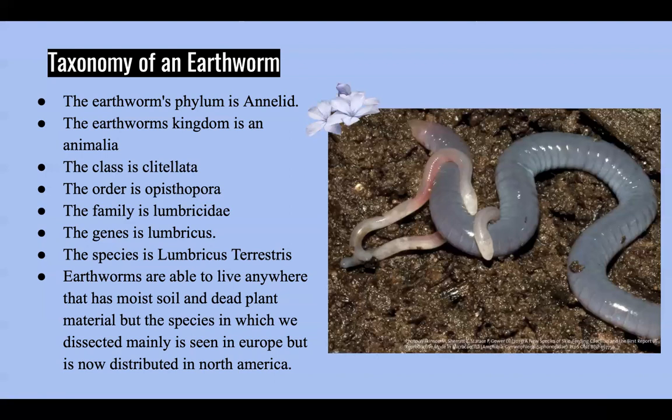And earthworms are able to live anywhere that has moist soil and dead plant material, but the species which we dissected in class is mainly seen in Europe, but now is distributed throughout North America.